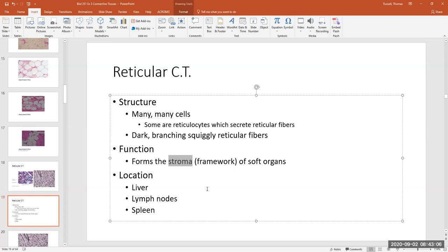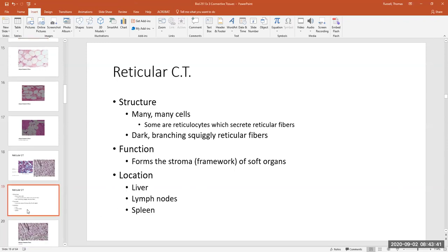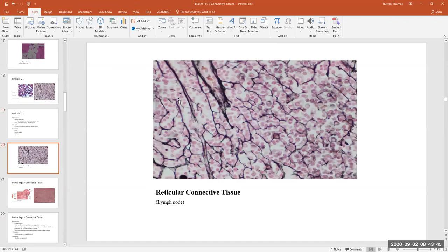Some locations of reticular connective tissue include the liver, lymph nodes, the spleen, and red bone marrow. In these areas the framework of these soft tissues is formed by reticular connective tissue. Looking at another slide, you can see all the little reticular cells — these thick, short, branching, dark fibers give the tissue its structure and maintain its shape. They run in all directions to give support in three dimensions.